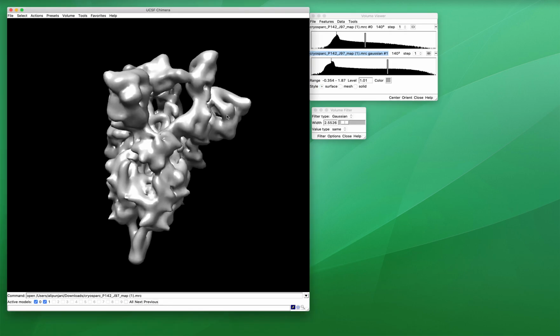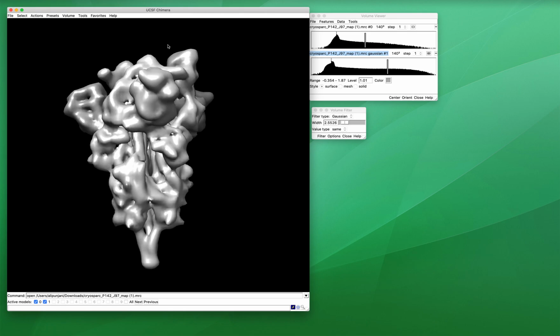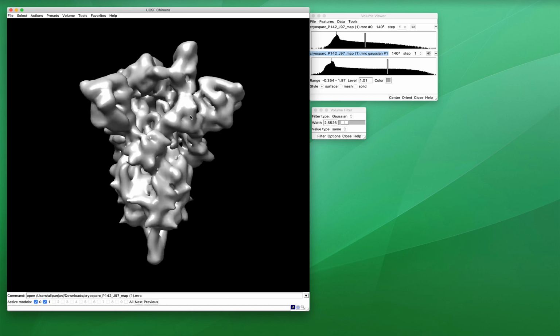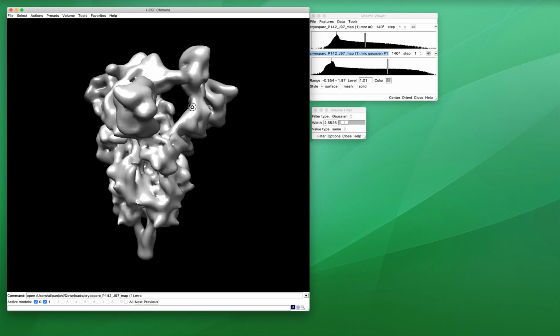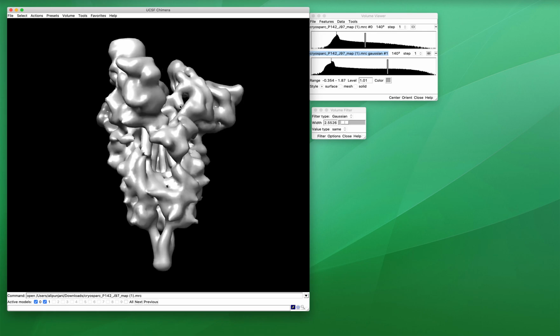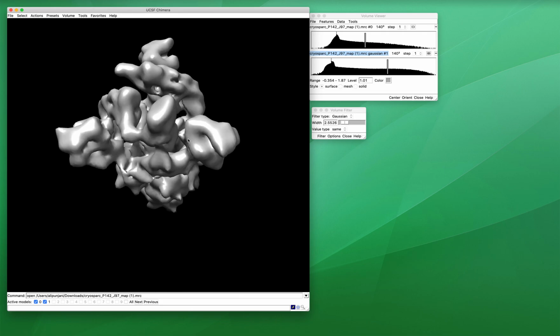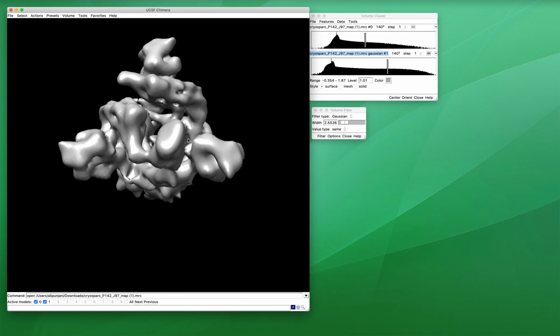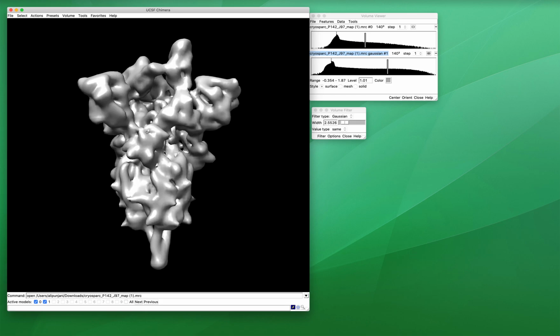As I mentioned, the exact position of the boundaries is not important, nor is the shape of the segmentation that we do. All we need to care about is essentially the places where we want to cut the mesh. Those boundaries should be in the right place, but there's a lot of latitude in specifying this, and there's no question of hardness or softness of a mask or any other consideration there. We just need to separate our boundaries cleanly. So this is a reasonable filter level to start with.